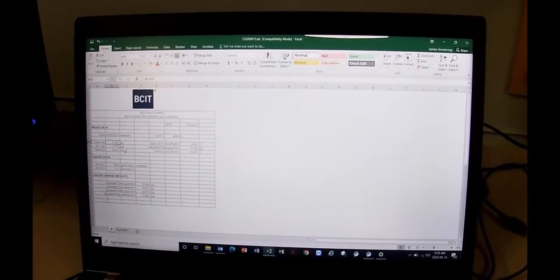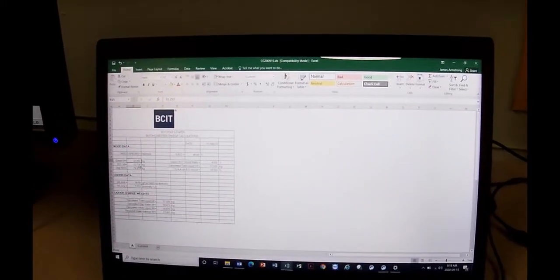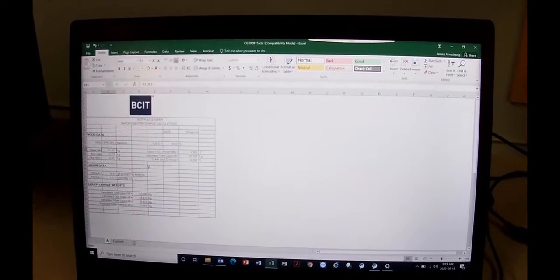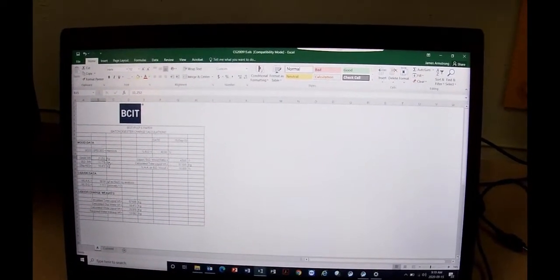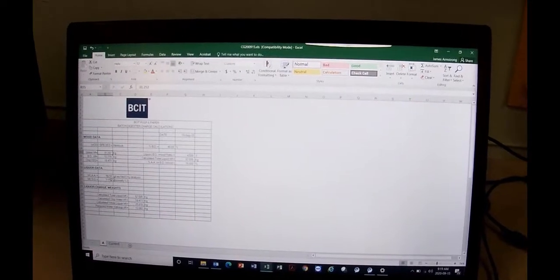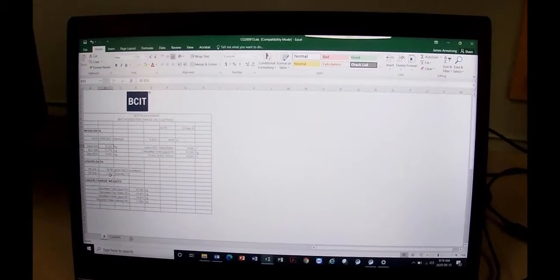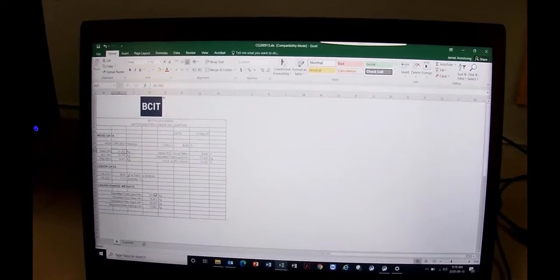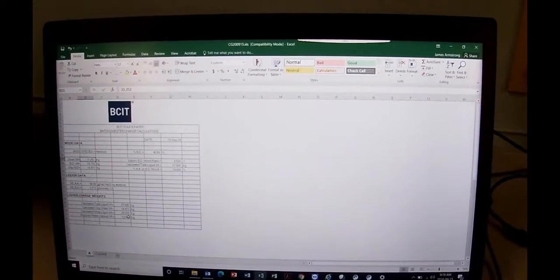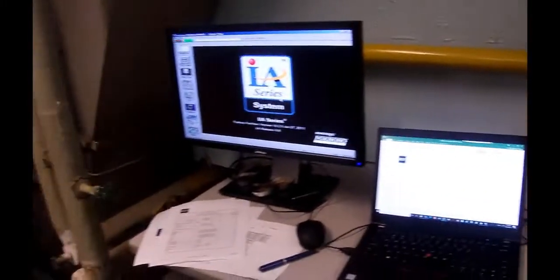Okay, so on the Excel spreadsheet, I entered in the amount of bone dry fiber, the 40.89%, and I entered in the green weight. Based on the percent bone dry, it calculated the amount of water and the bone dry weights. The 4.5 to 1 liquor to wood ratio is normal. The total liquid weight is a matter of taking the water weight and adding that to the amount of water that we're going to put in, and it'll come out to 57 kilos of total liquid. I had to enter in the active alkali, 98.58 grams per liter as sodium oxide by analysis. SG 1.113. It calculated total weight, chip water weight comes from up there, and then it calculates the amount of white liquor and the amount of water required, and it is exactly the same numbers as we got on that Foxboro DCS.